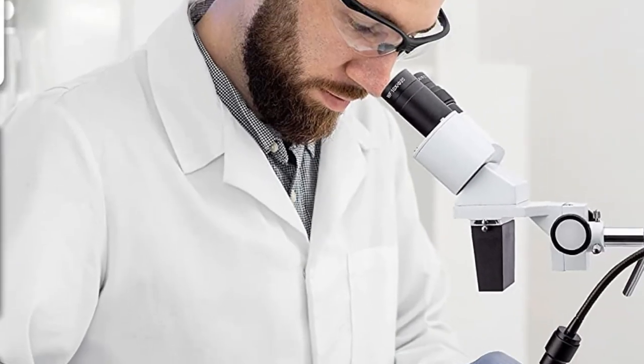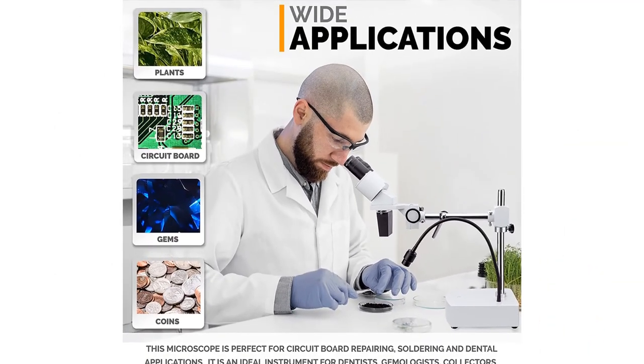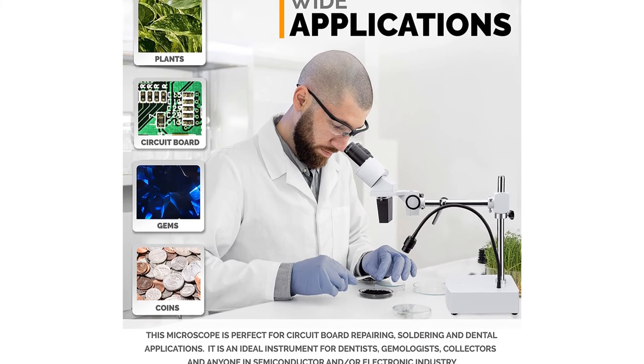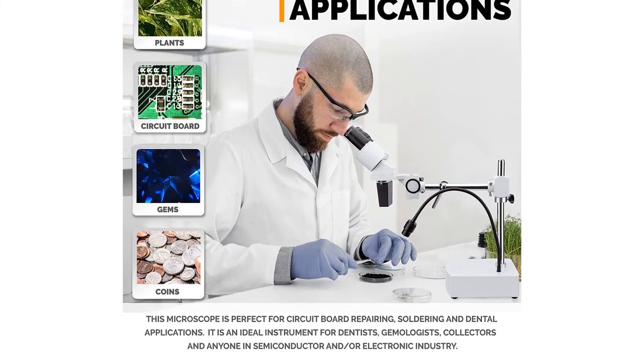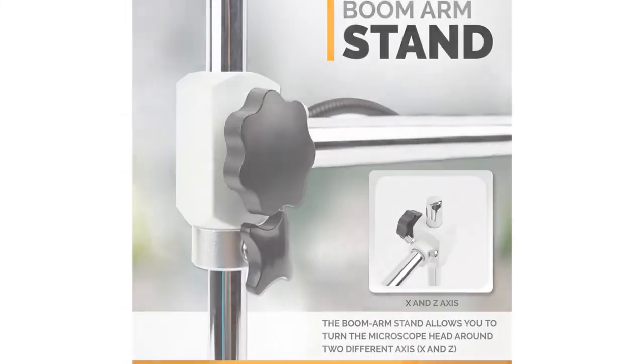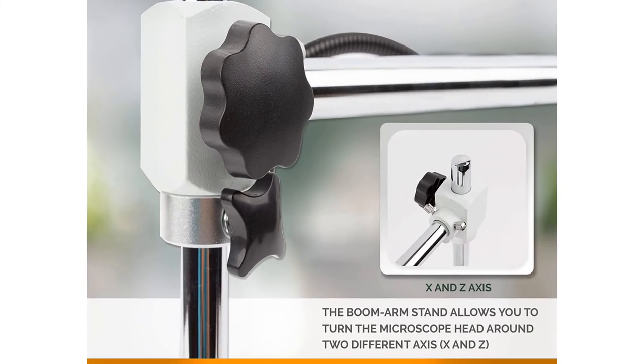Typically, microscopes only have one fixed source of light from the top or bottom, or sometimes both. However, that can be limiting when working with multi-dimensional items. Fortunately, the SE400Z uses a bendable LED light, meaning that you can adjust its position for maximum illumination.